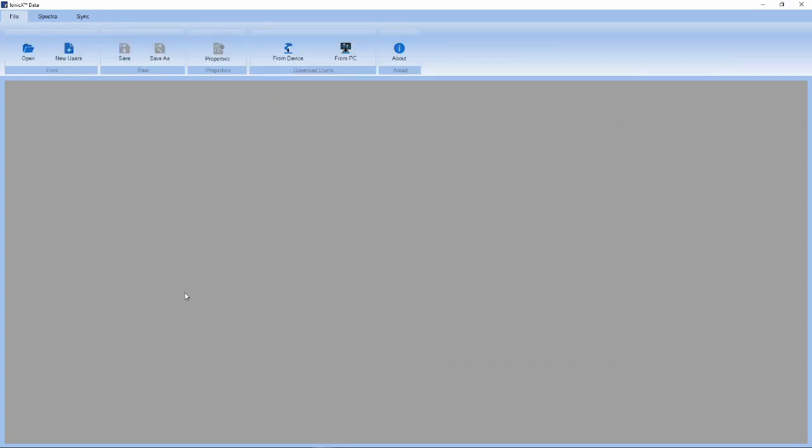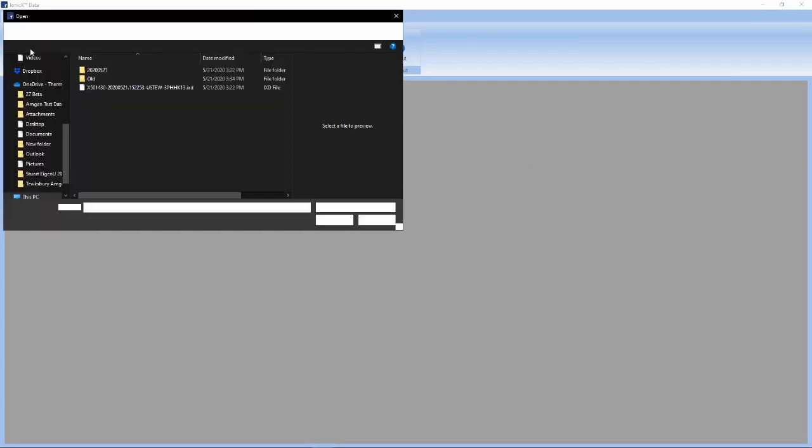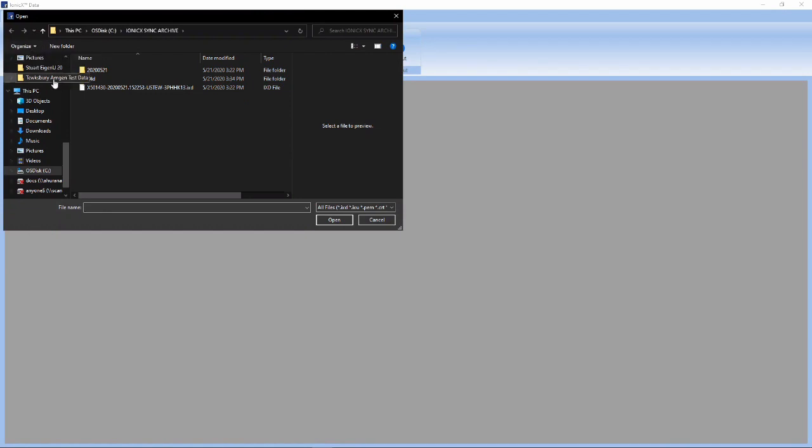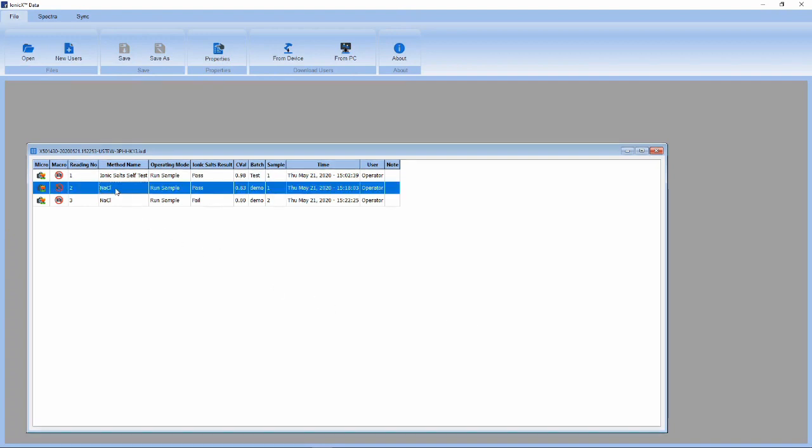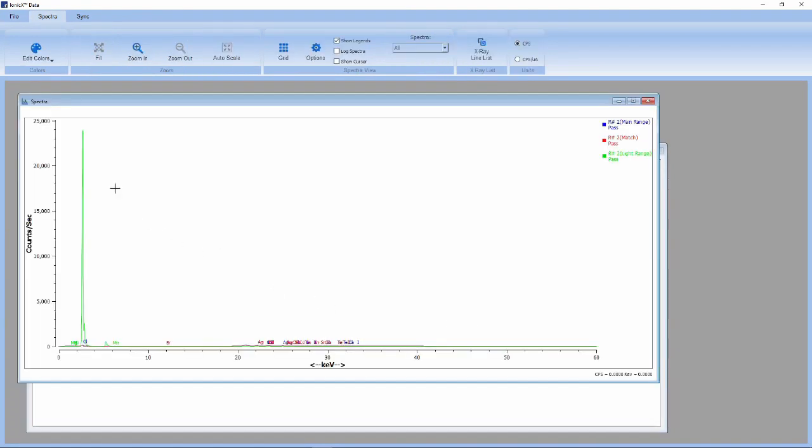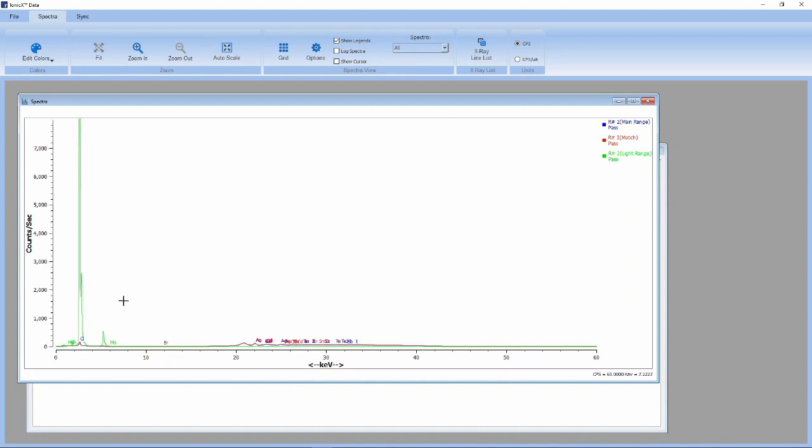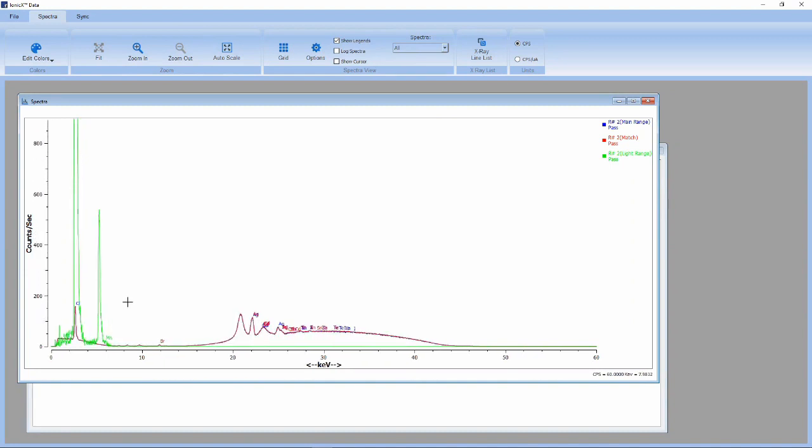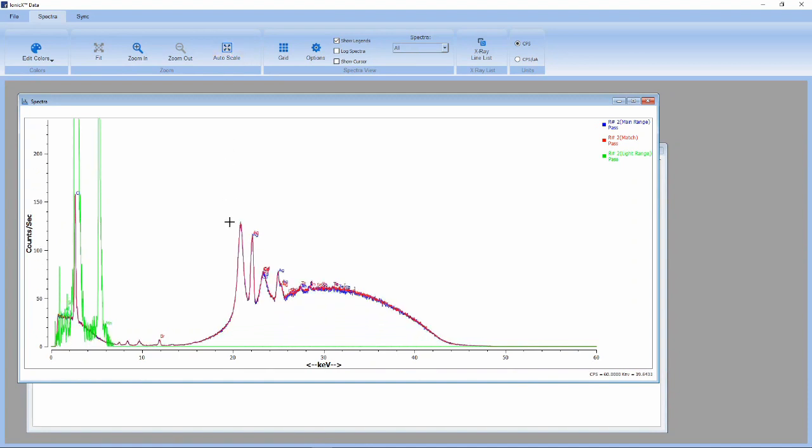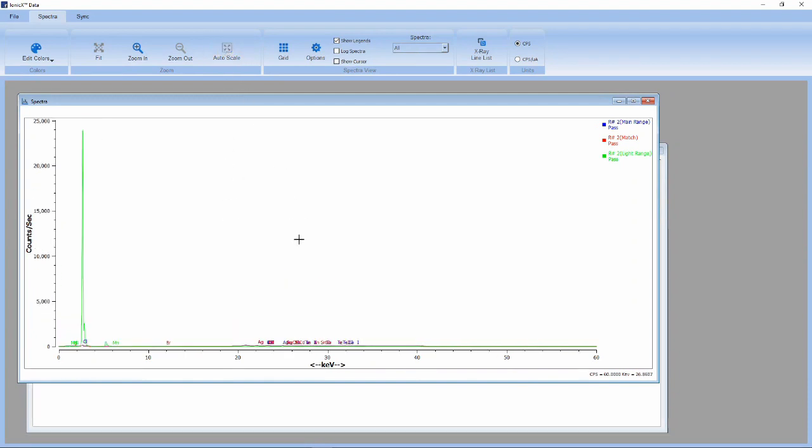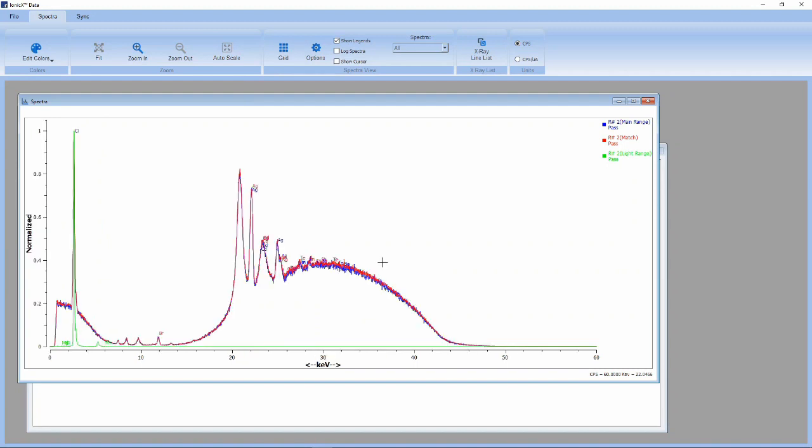Using Ionic X Data, one may review the data collected prior to sync. Click Open and select a .ixd file that was recently synced to view all the data collected during use. Double-clicking on the sodium chloride pass run, we can see the spectral overlay and match for the sodium chloride sample. One may zoom in on the total spectrum, autoscale the spectrum, or view a normalized XRF spectrum.